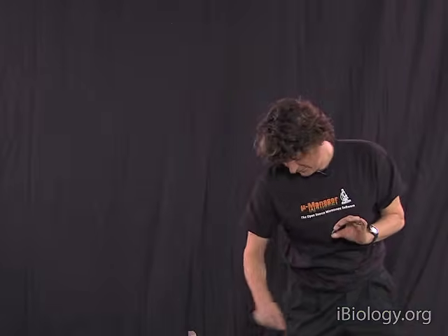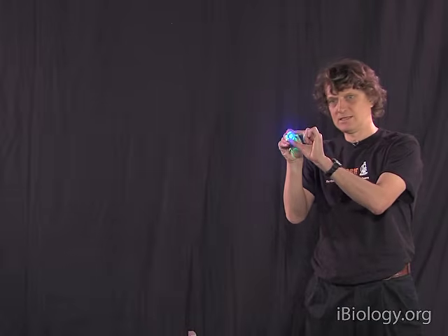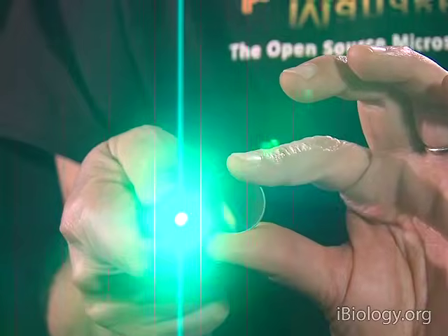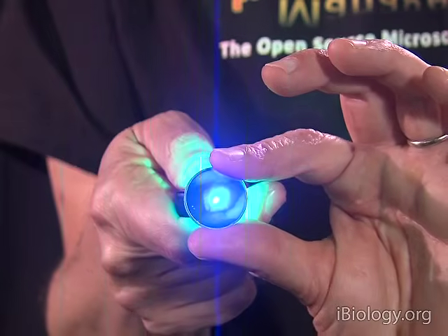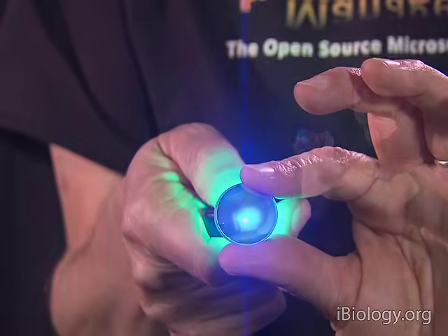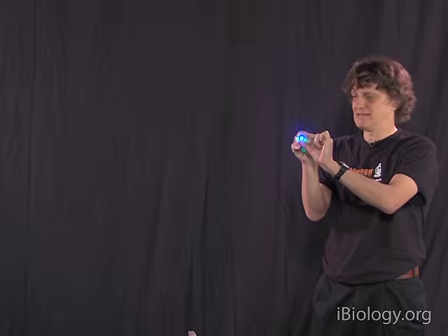Now when I would have a green light source and hold that up and go through this filter, you will see that it gets a lot dimmer. And not only that, you may also notice that there's actually a little bit of blue coming through, and that is because this green LED is not purely green but also has a slight bit of blue light in it.